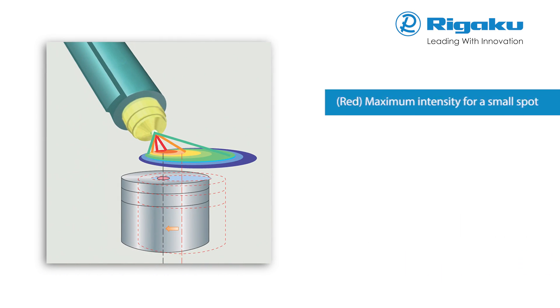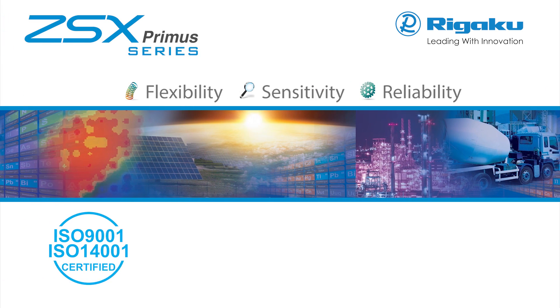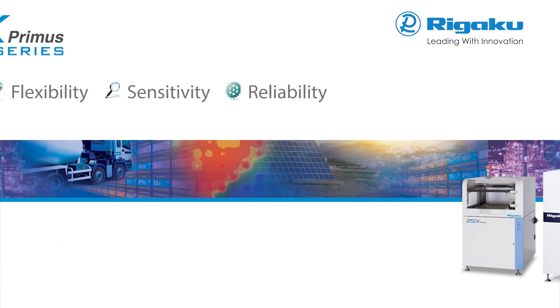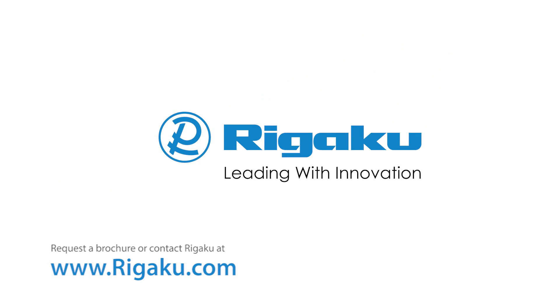An automated sample stage, a CCD camera system and intelligent software position the sample so the brightest portion of the X-ray beam is centered on the small spot. Rigaku ZSX Primus series delivers the utmost in flexibility, sensitivity and reliability — the three core requirements of superior performance. Contact Rigaku today for a brochure and more information.